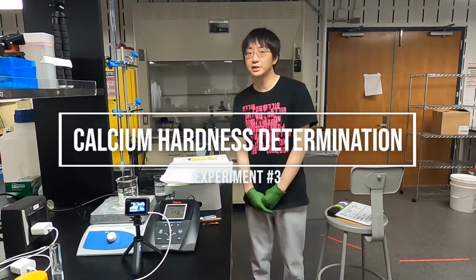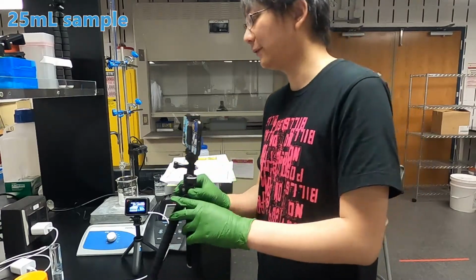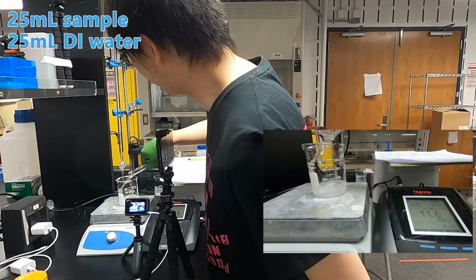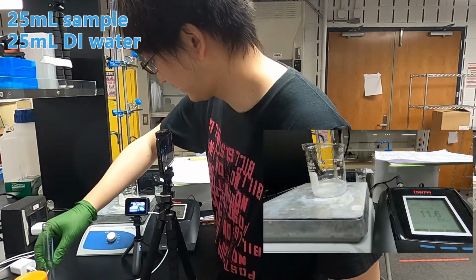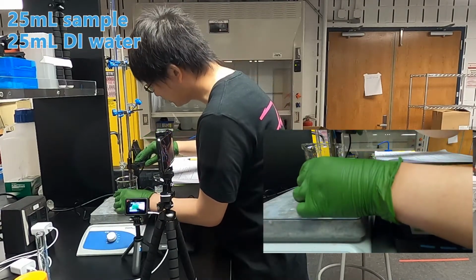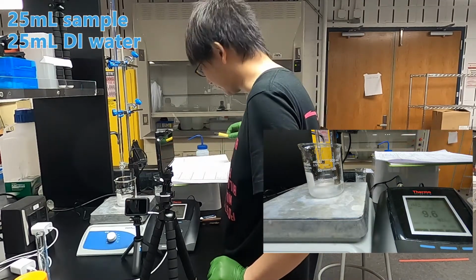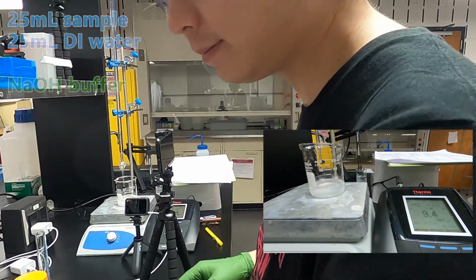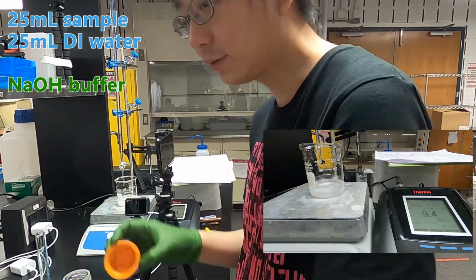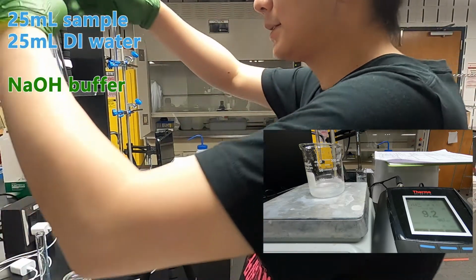So now let's measure the calcium hardness. First, we add 25 mL of DI water into the sample. And then we measure the pH of the solution, and we write down the pH of our sample. Next, we add 10 milliliters of NaOH into the solution, but here I don't have enough sodium hydroxide, so I use potassium hydroxide instead.